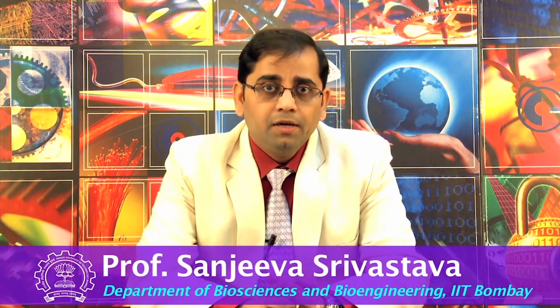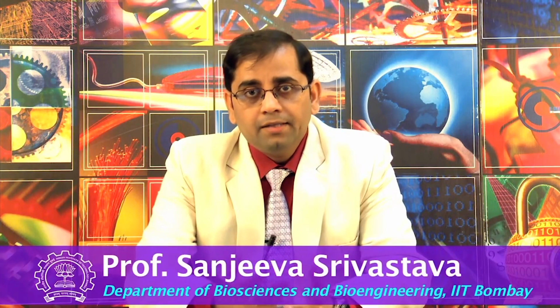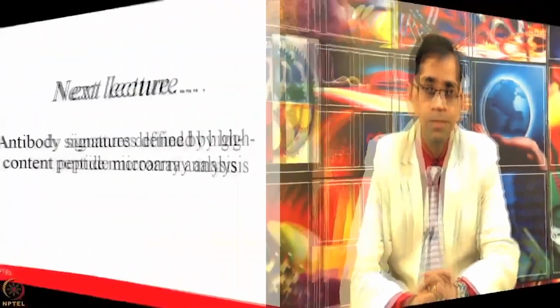Nevertheless, reverse phase protein arrays have been used in clinics for a long time, not as a high throughput technology platform, but even to test the abundance of a given protein. Clinicians have been using it for a long time, and this also shows the need for reverse phase protein array based platforms for clinical applications. So, knowing the basics as well as the possible applications, I hope you are now excited to understand this technology in much more detail, which can be really helpful if your goal is to deliver something to the clinics for translational research.